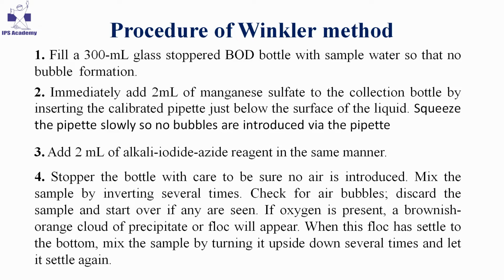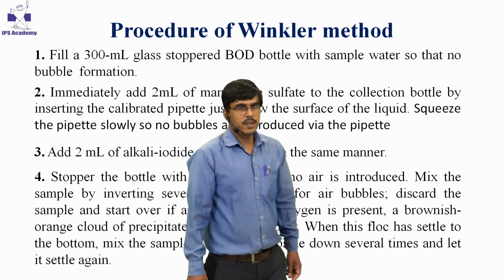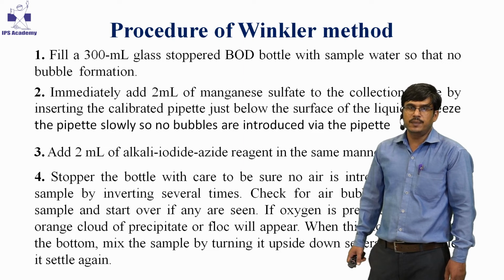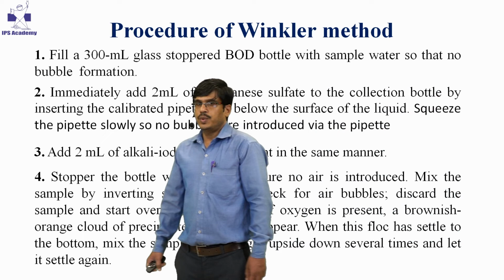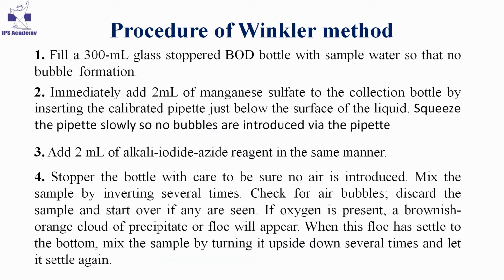Next, we have to add 2 ml of alkali iodide azide reagent in the same manner so that no oxygen dissolves in water from the environment. Then we have to stopper the bottle so that no air is introduced from the environment.